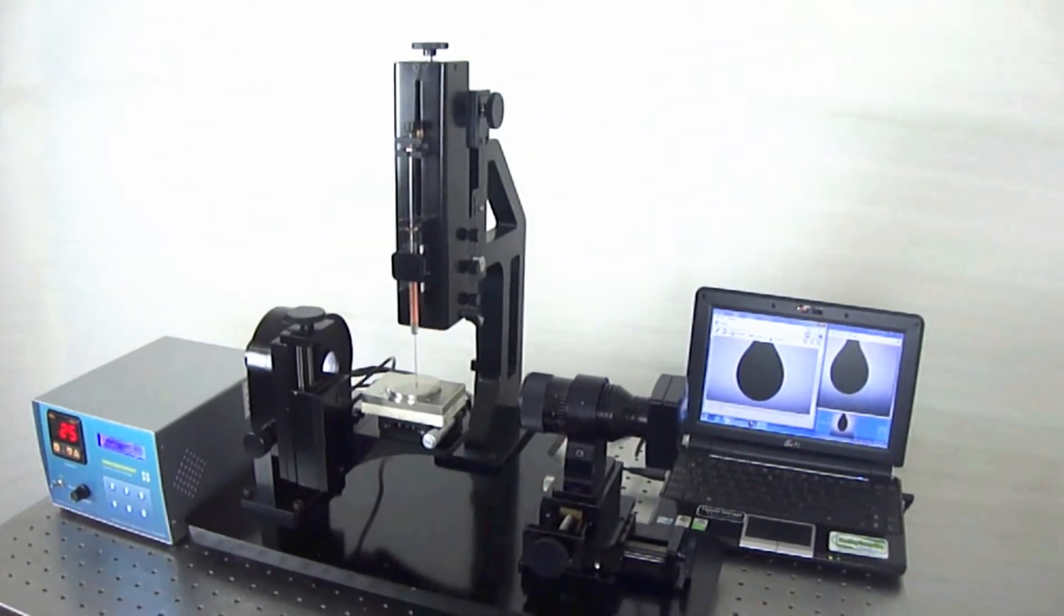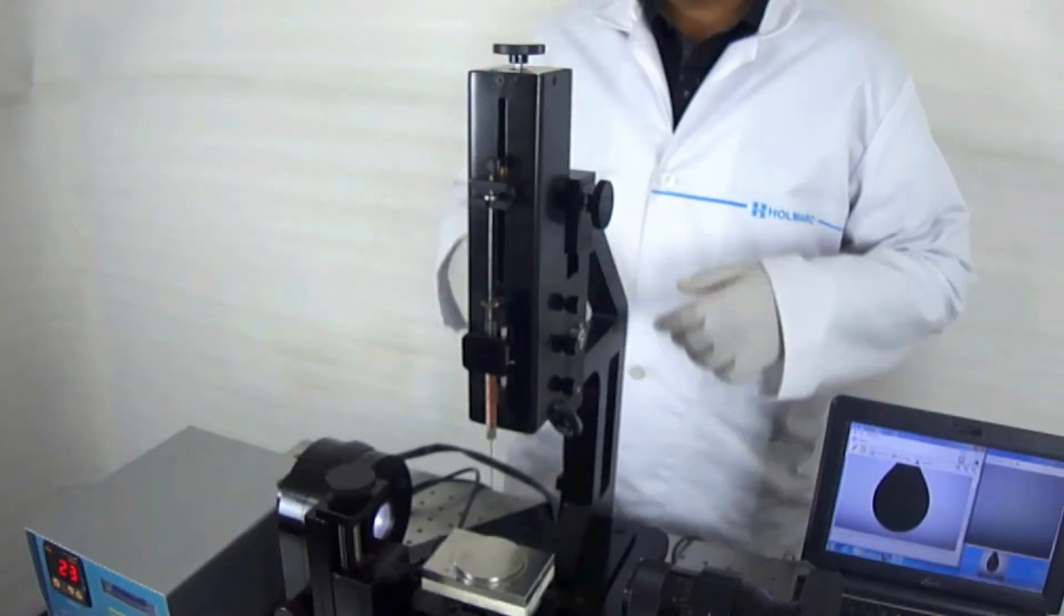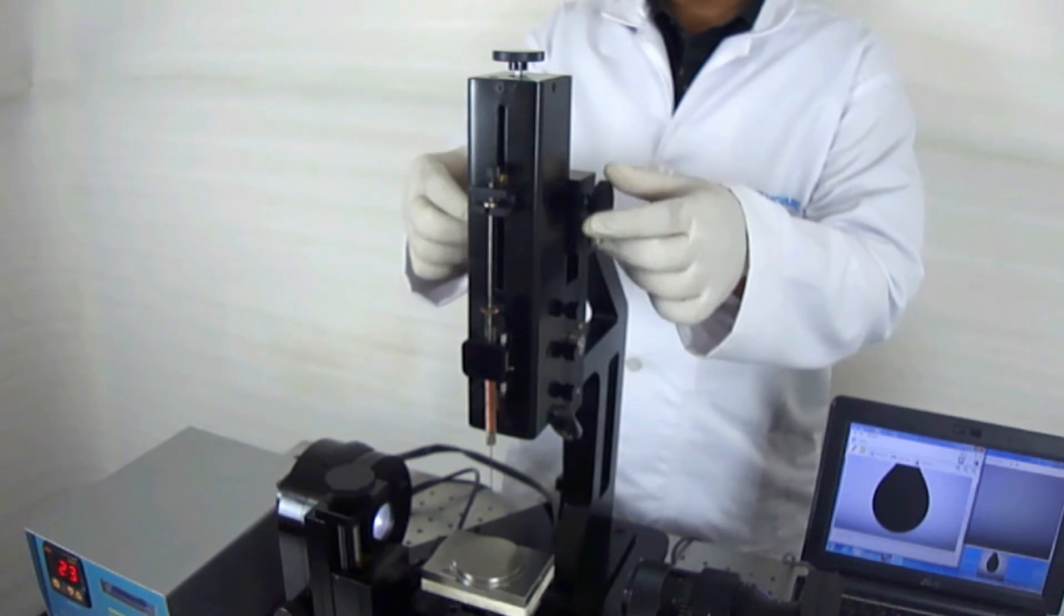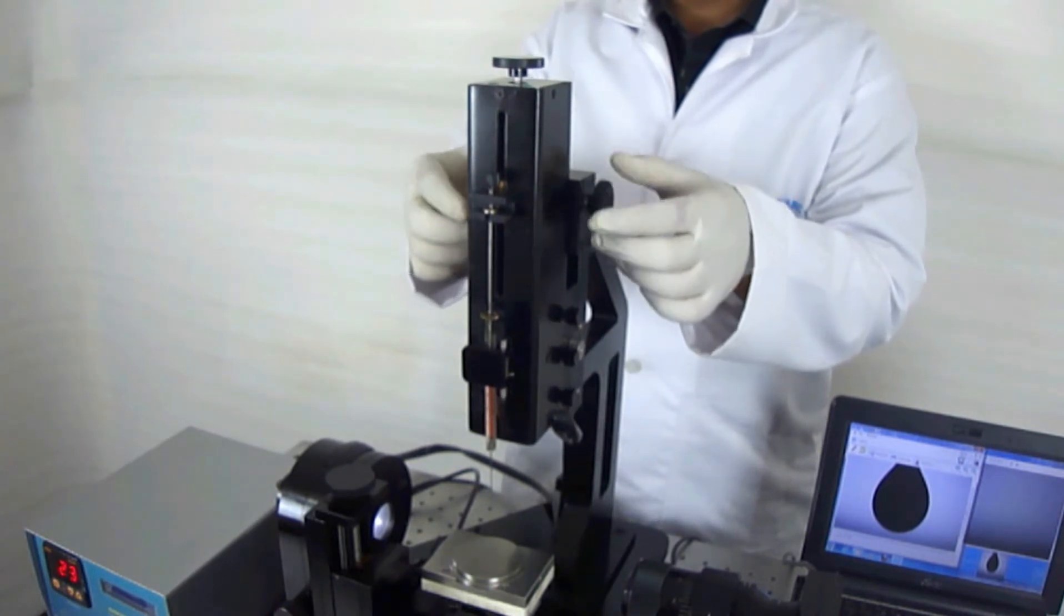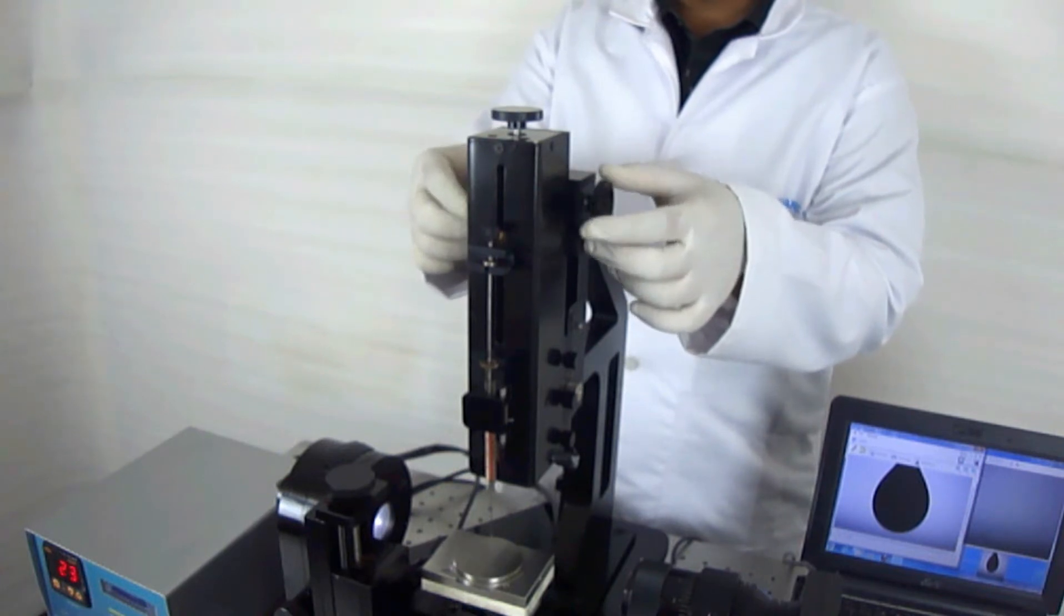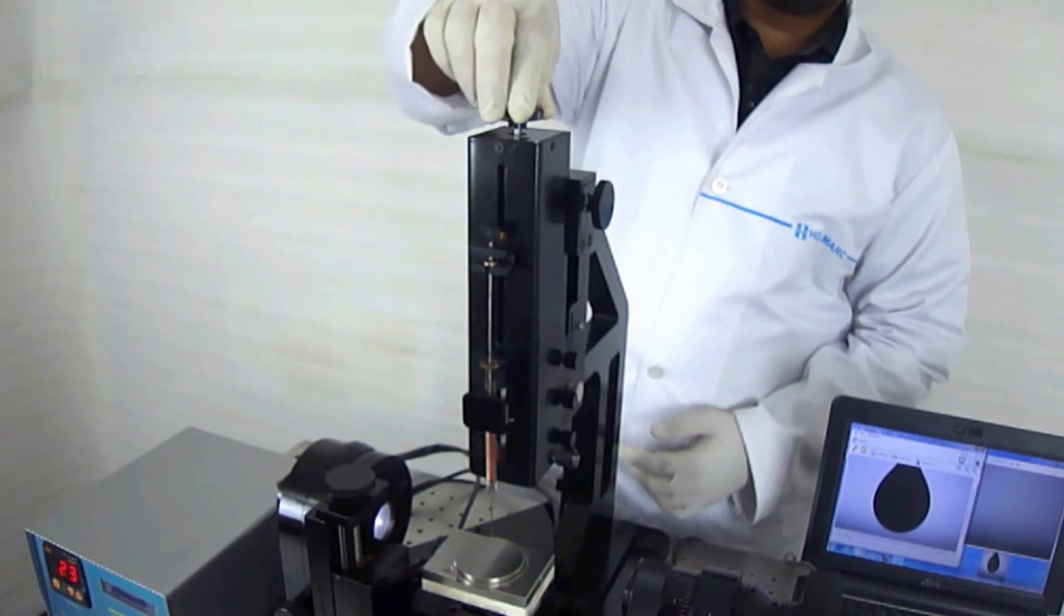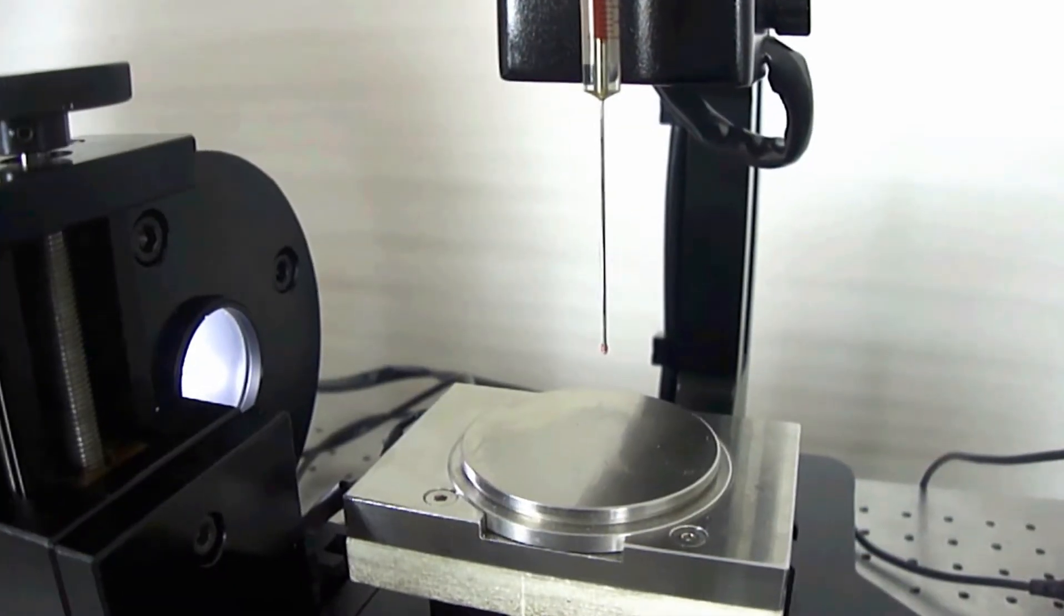with rotatable substrate holder and temperature control. To start with, the dispensing unit has vertical height adjustment and also a manual dispensing knob. Automated dispensing is also available, which is one of the key features of the instrument.